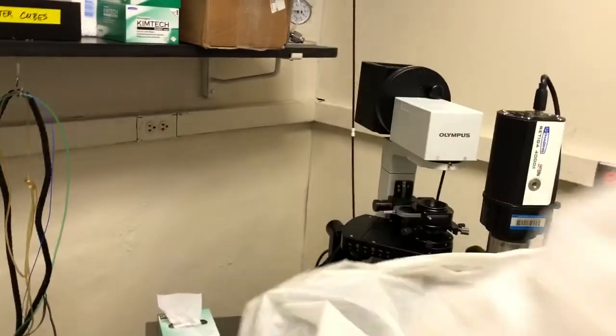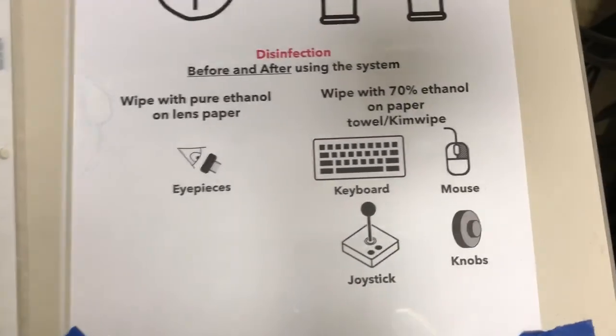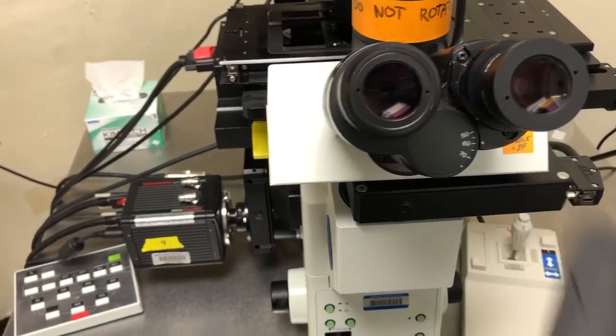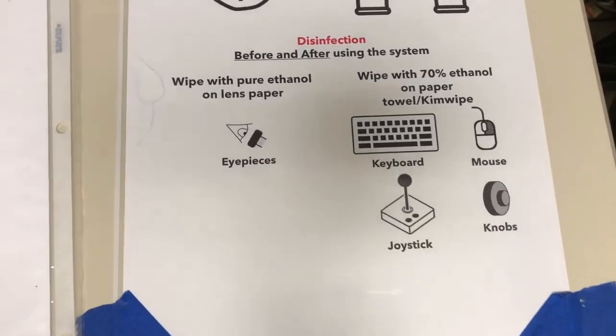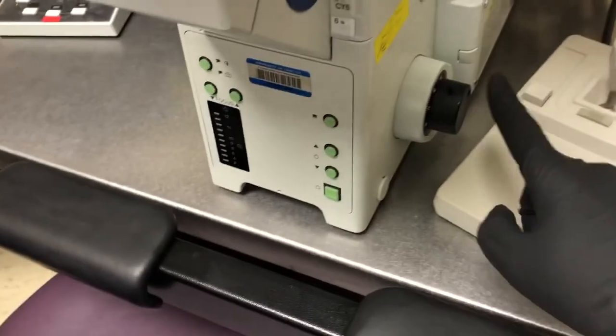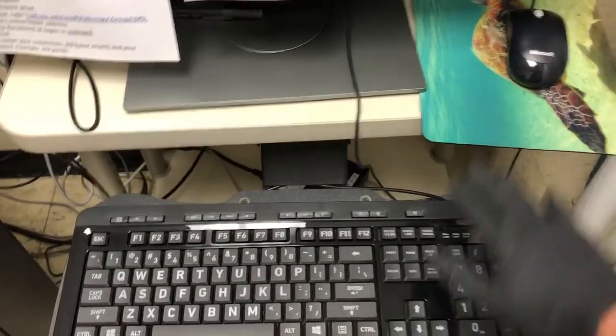Let me first remove the dust cover and point out the things that need disinfection. We're going to use pure ethanol on lens paper to wipe the eyepieces. Then we're going to use 70% ethanol on a paper towel or kimwipe to wipe the knobs, the joystick, the keyboard, and the mouse.